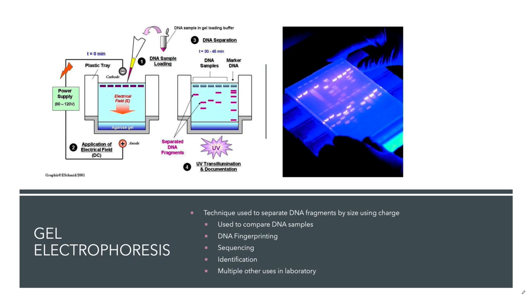Hello and welcome to part 2 of biotechnology in microbiology. So for this particular short lecture, we're going to look at gel electrophoresis. This tool is used quite a bit. It is used to separate fragments of DNA according to their size and their charge.